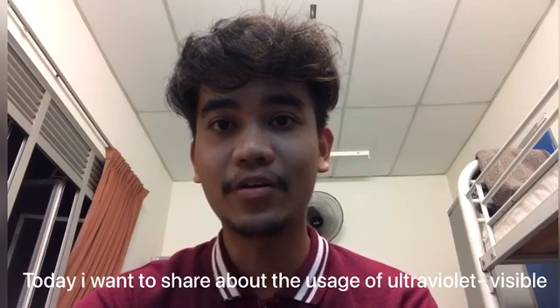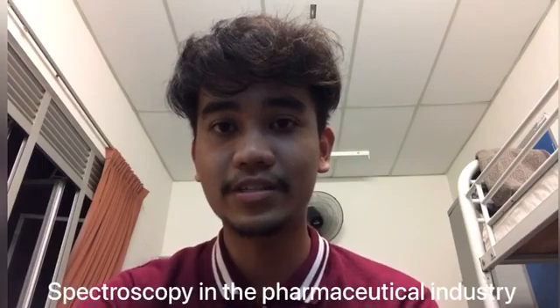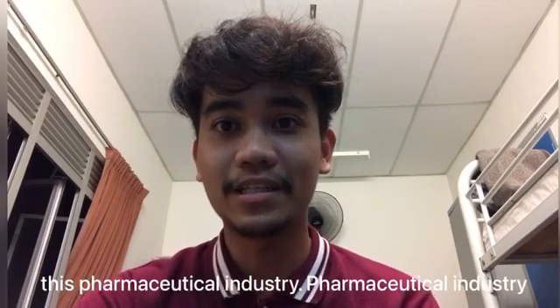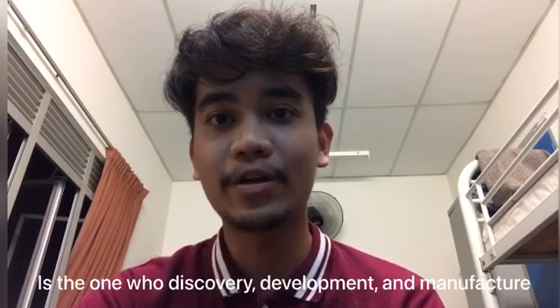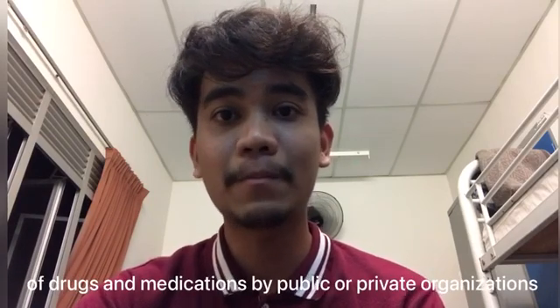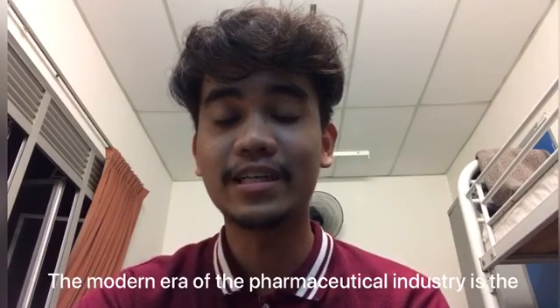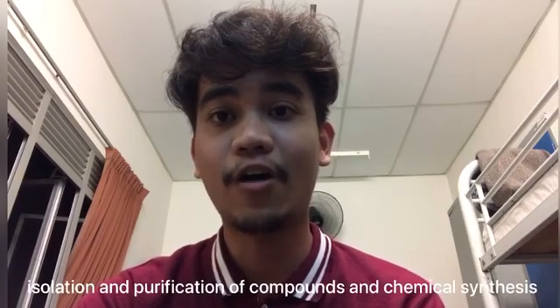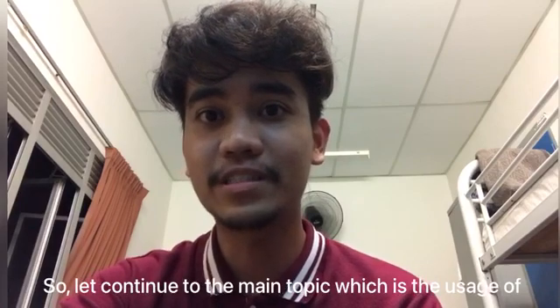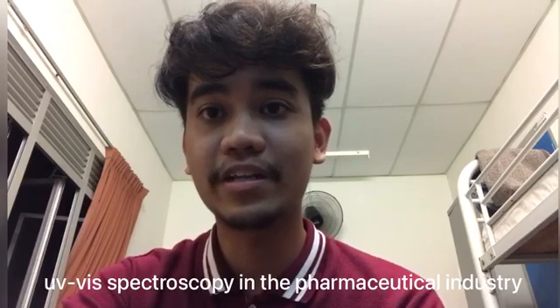Today, I want to share about the usage of ultraviolet visible spectroscopy in the pharmaceutical industry. Before we start, I want to explain a little bit about this pharmaceutical industry. The pharmaceutical industry is the discovery, development and manufacture of drugs and medication by public or private organizations. The modern era of the pharmaceutical industry is the isolation and purification of compounds and chemical synthesis. So, let me continue to the main topic, which is the usage of ultraviolet visible spectroscopy in the pharmaceutical industry.